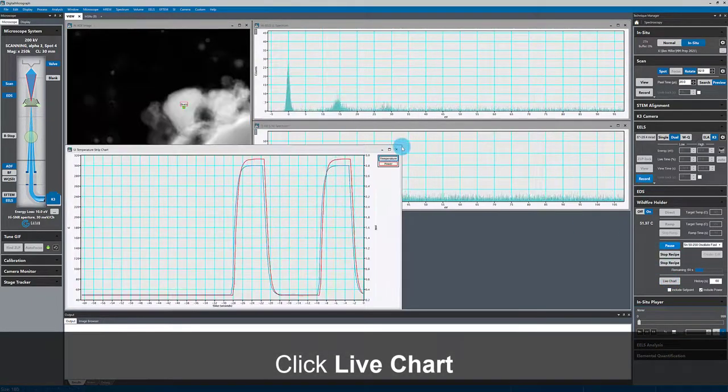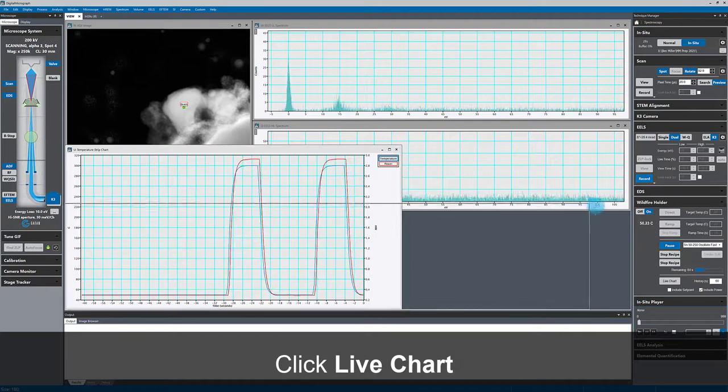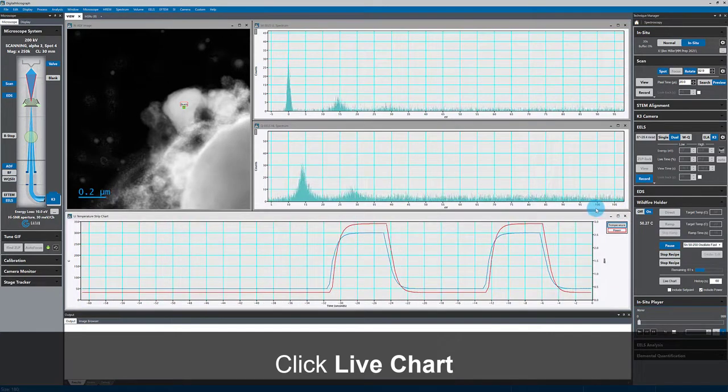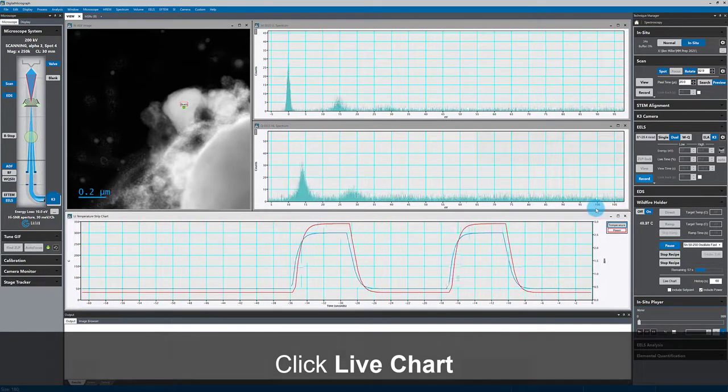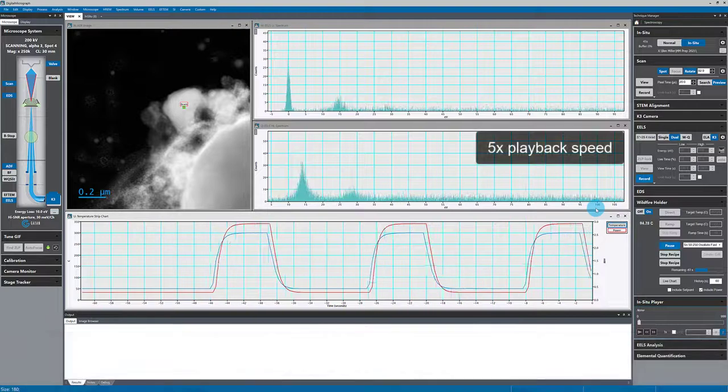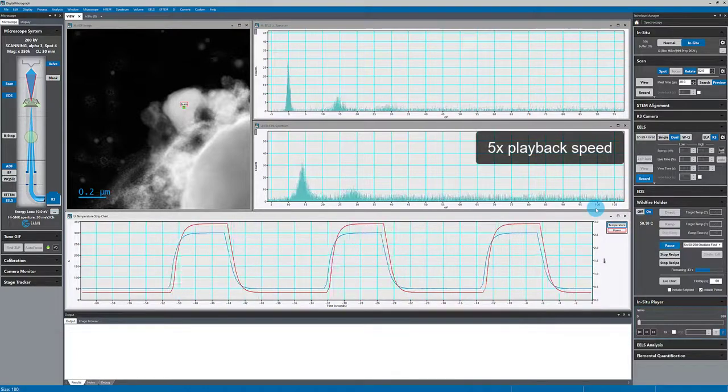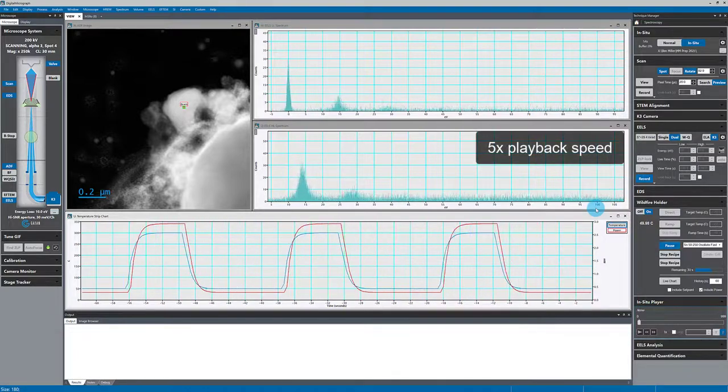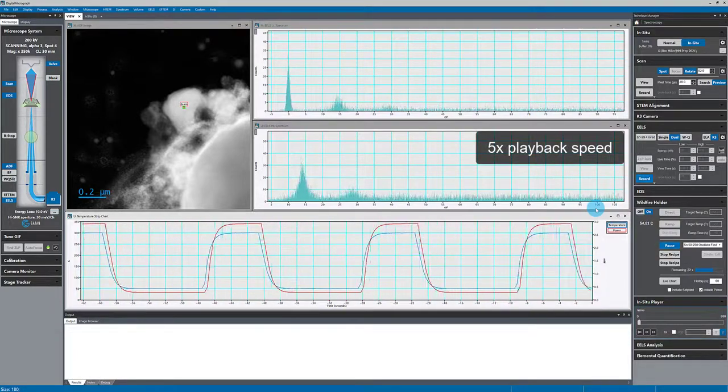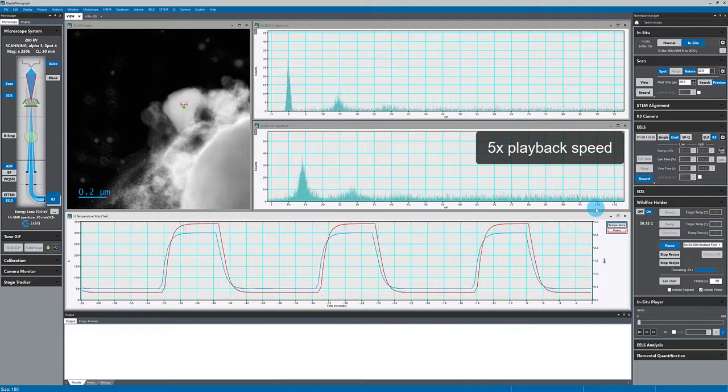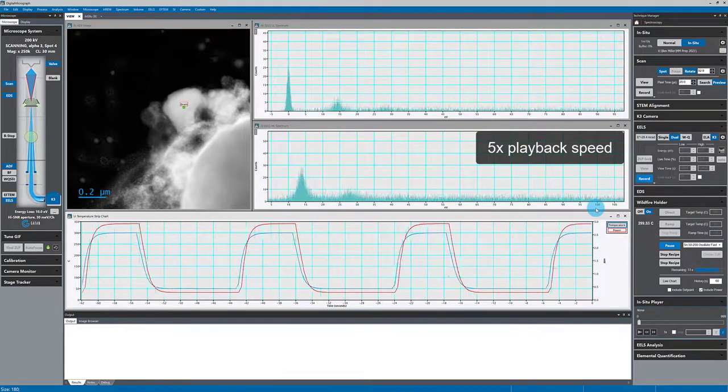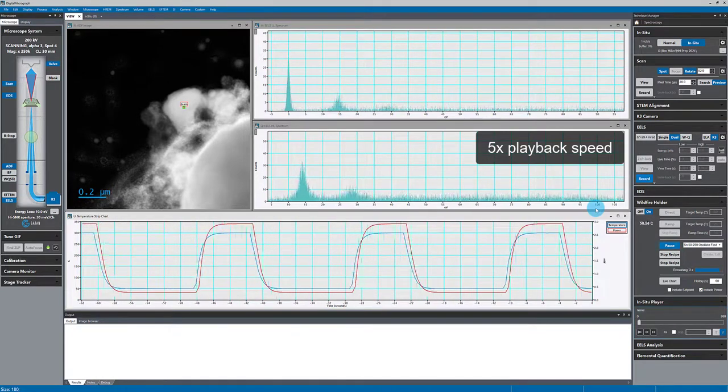In that live chart, I can see that the temperature is ramping up to 250 degrees Celsius, which is above the melting point of tin, and then back down to 50 degrees. This recipe is set up to repeat the cycle several times.